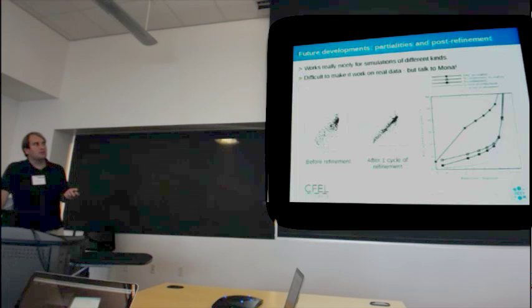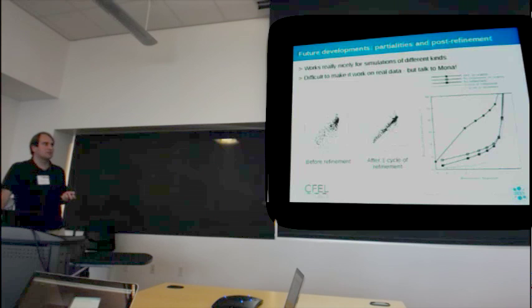Note actually that just applying the model gives you these lines here. So the initial crystal parameters just from indexing seem to be quite accurate, in this case accurate enough to make some good partiality estimates. And then we refine that, and we get basically down to R equals close to 0.